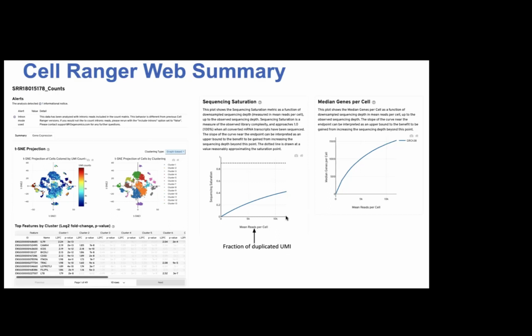It's like collecting cards, and you have nine and you need the last one, but you'll never draw it, right? So it's not worth it to go on. But this is kind of showing you that you could have done more sequencing and you would have probably gotten more information out. That's just what that plot means. This is somewhat similar.